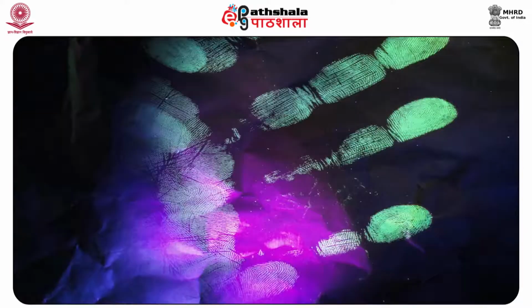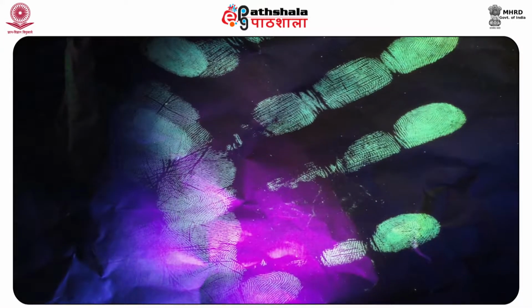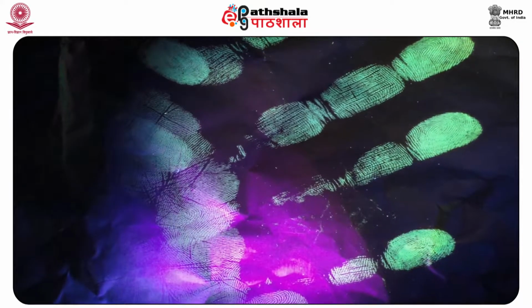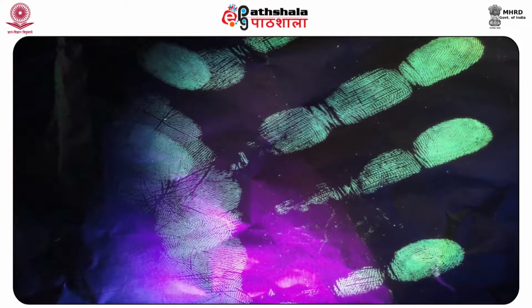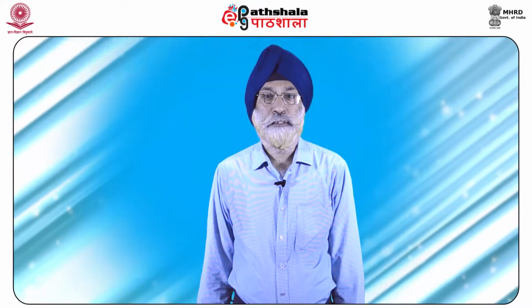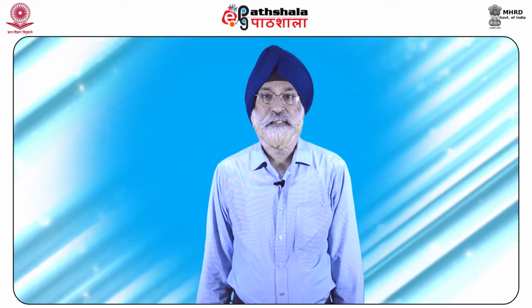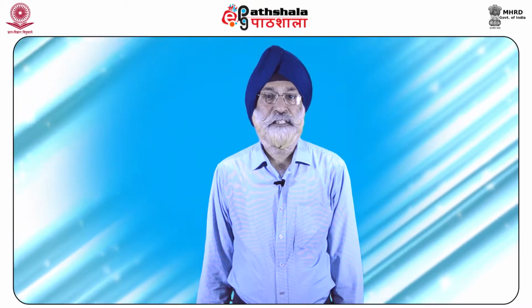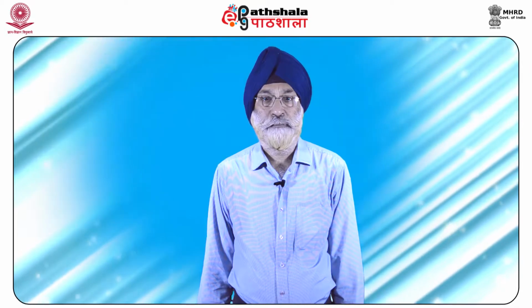Introduction. A latent fingerprint is formed when the sweat pores of papillary ridges leave a deposition of perspiration on a surface with which the finger has been brought into contact. Human skin possesses three types of sweat glands: the eccrine glands, the apocrine glands and the sebaceous glands, the secretions of which contribute to the fingerprint deposit.